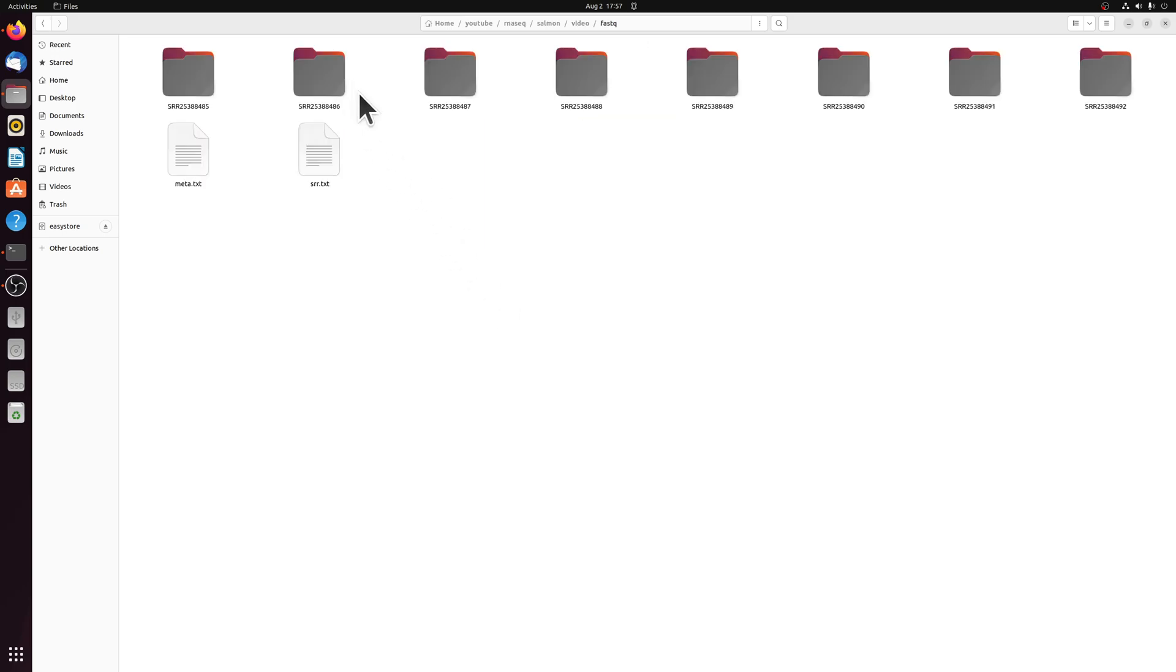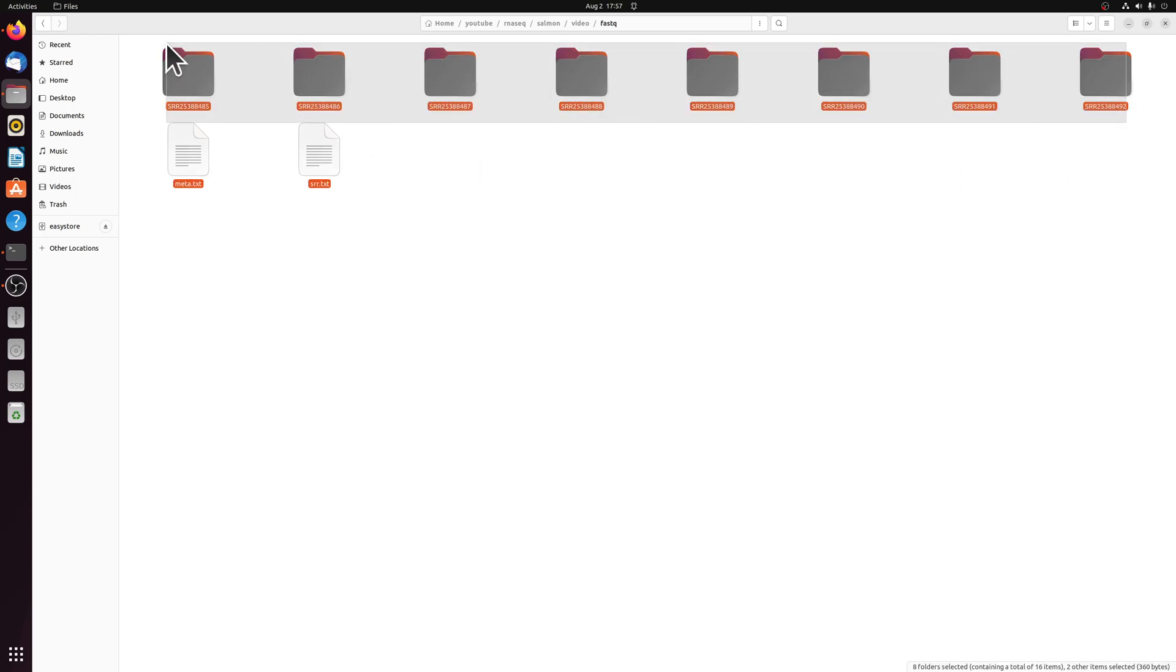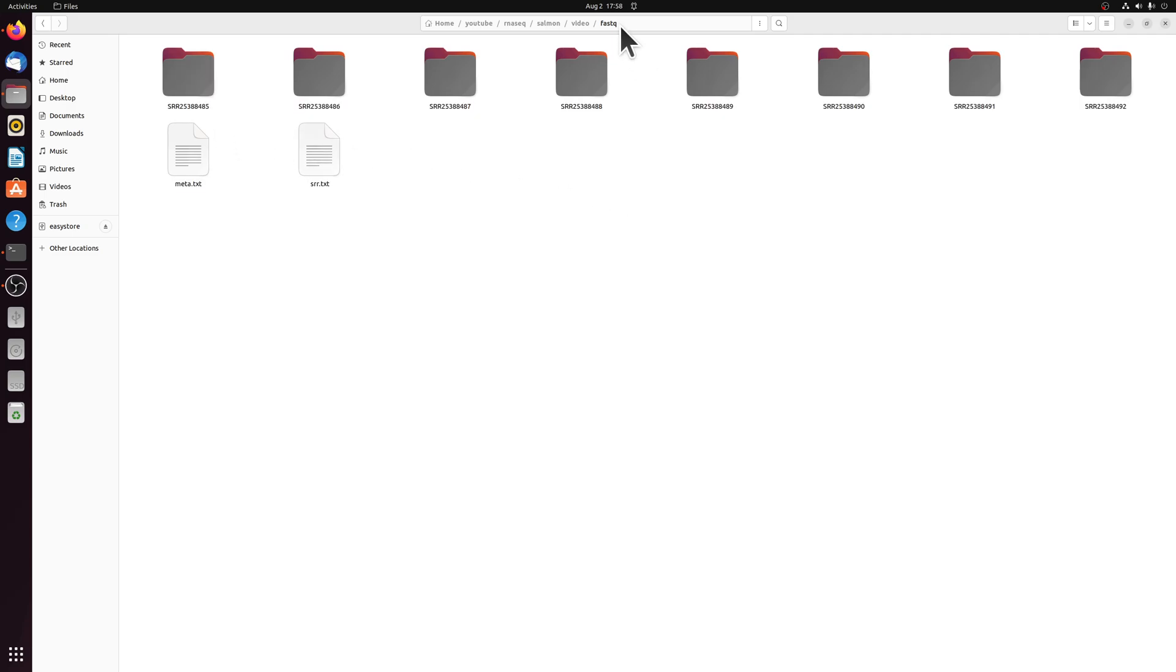You can have these set up however you want, you'll just need to point to them later. But if you want to follow along exactly with this tutorial, I have them in a FASTQ parent directory.